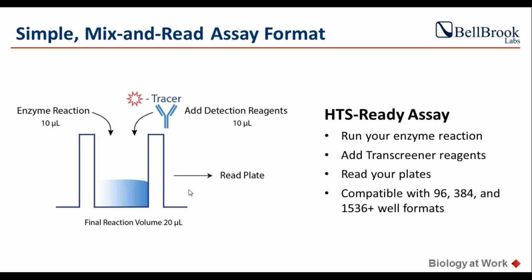And we will show some of the applications where we need to run it in a kinetic mode or real-time mode to get some off rates and whatnot. But basically, this follows the simplistic homogeneous format. It's a direct assay. It's a homogeneous assay, but it also follows the simple HTS ready mix and read format.